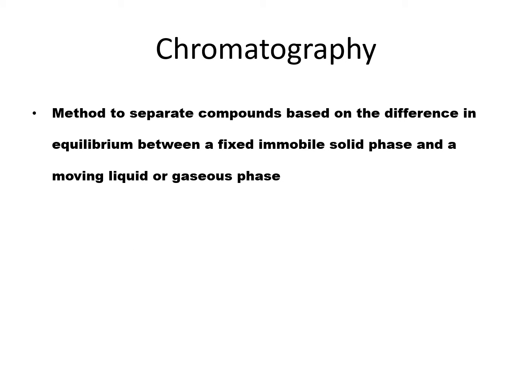So chromatography is a method which we use to separate compounds based on the affinity of the compounds to the stationary phase and a mobile phase.